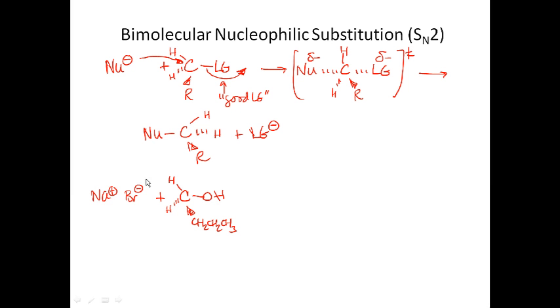The problem with this reaction as it stands is that since this is a primary carbon where the substitution is going to occur, it has to go by the SN2 mechanism. You have no choice when you're a primary carbon. You have to undergo substitution by the bimolecular pathway.